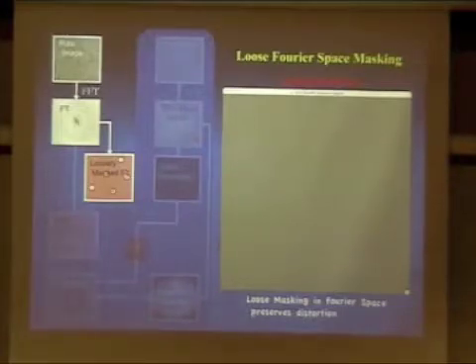Well, it's difficult to judge, because if you do not know how it should look, you would perhaps go for the wrong area for selecting your reference. Here is the trick to find out. When you select the reference, you don't select it from the distortion map. You select it from the one that we masked only for the lattice information. If you use that, you have a better chance of finding the best area according to your lattice parameter. If you are using the other, you are more likely to go wrong.